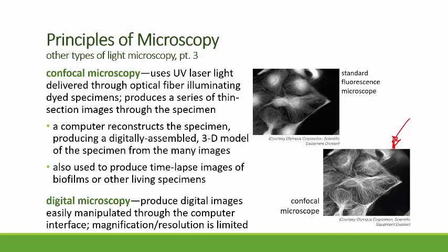manipulated through the computer, although you cannot achieve greater resolution. All you can do is digital magnification through the computer. You're not going to be able to increase resolution on those digitally magnified images. But it does allow false coloring later on, so that you can produce images where you highlight specific structures as well. It just provides the chance to work with that image to measure things or to highlight specific structures.